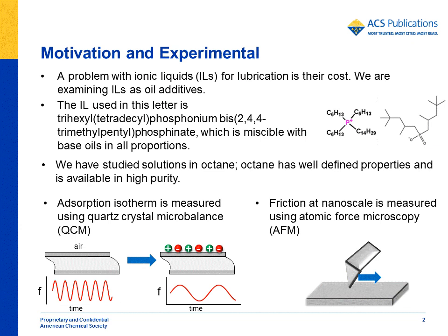To measure the adsorption isotherm of the IL onto the silica surface from octane, we used a quartz crystal microbalance, or QCM. The friction at the nanoscale was measured using atomic force microscopy, or AFM.